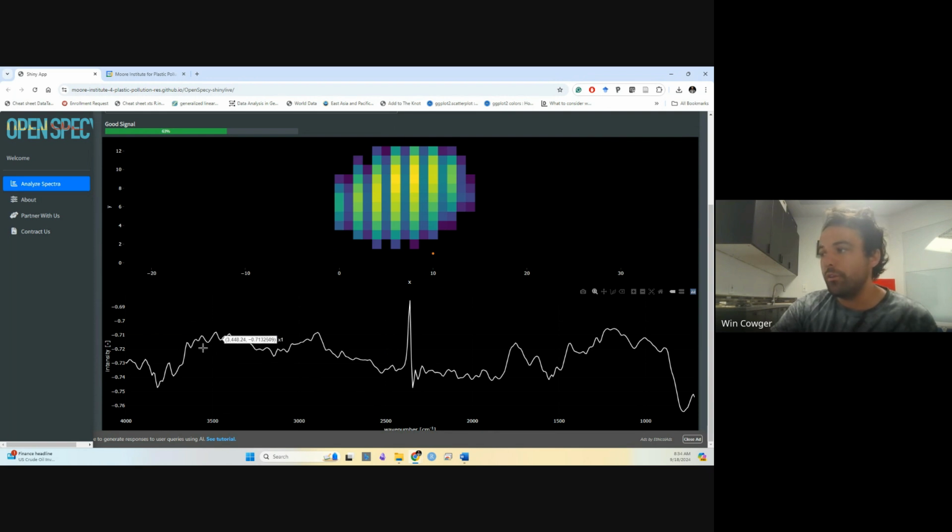So this is noise here. This is probably a peak. This is probably a peak. That noise region is pretty similar in its height off of what we call the baseline. It's similar in height to the peaks.